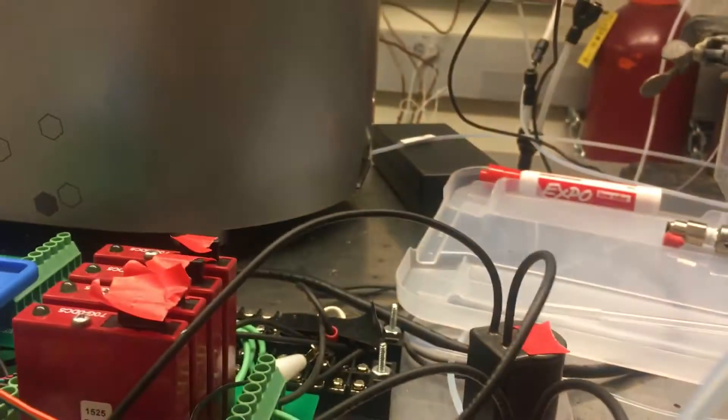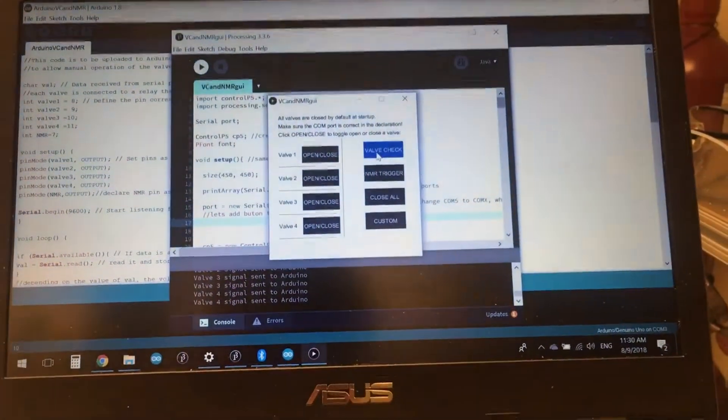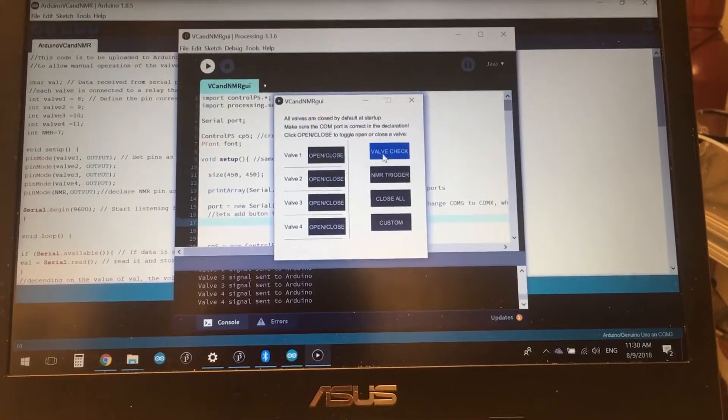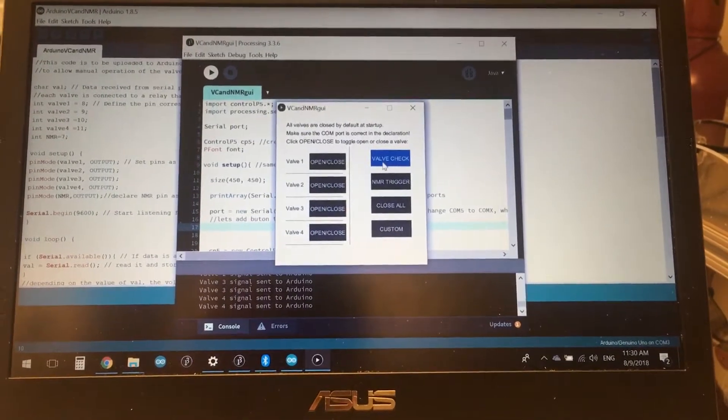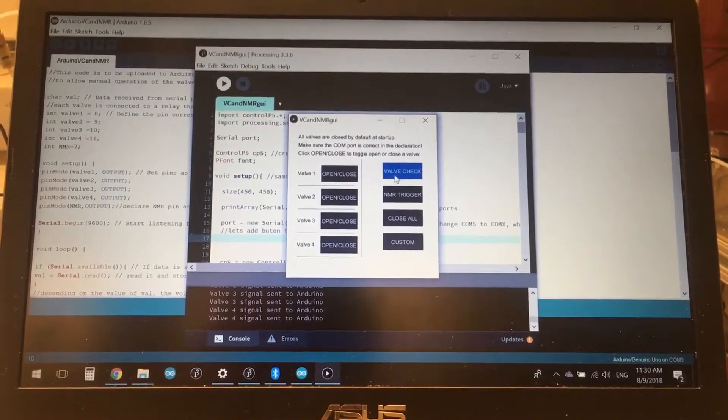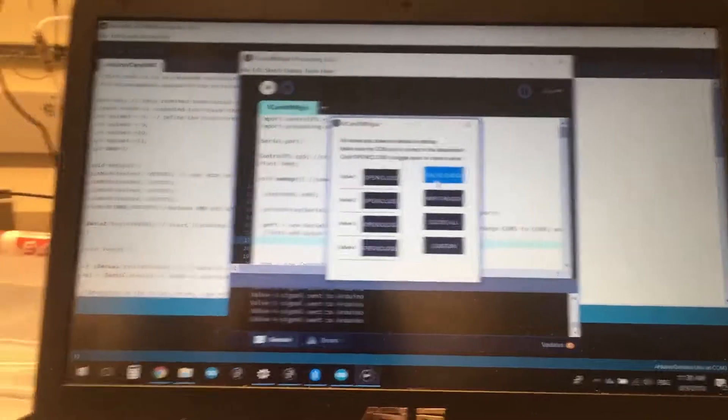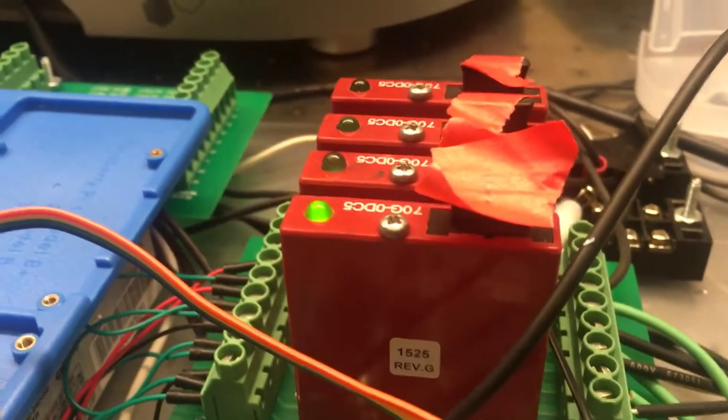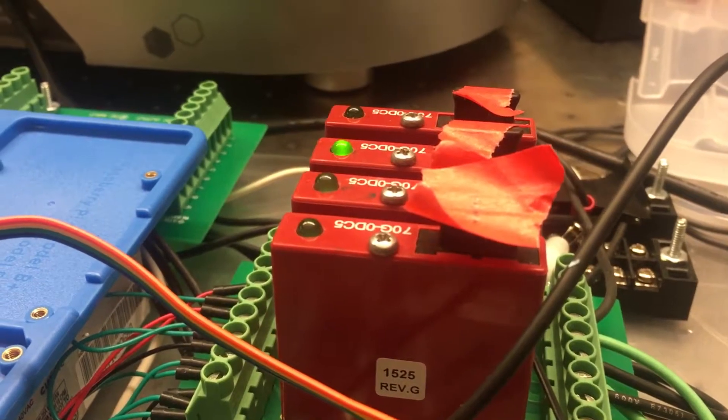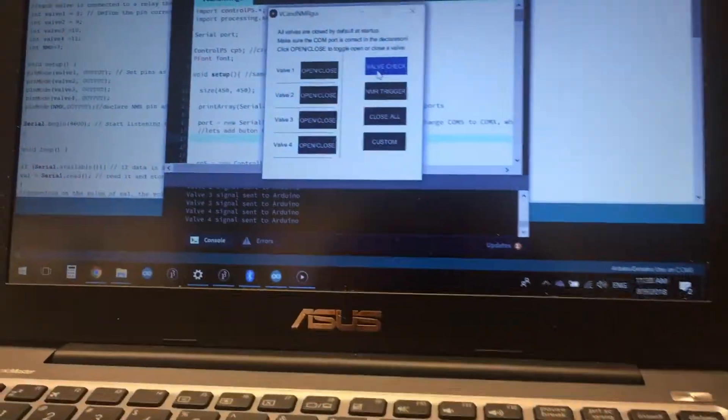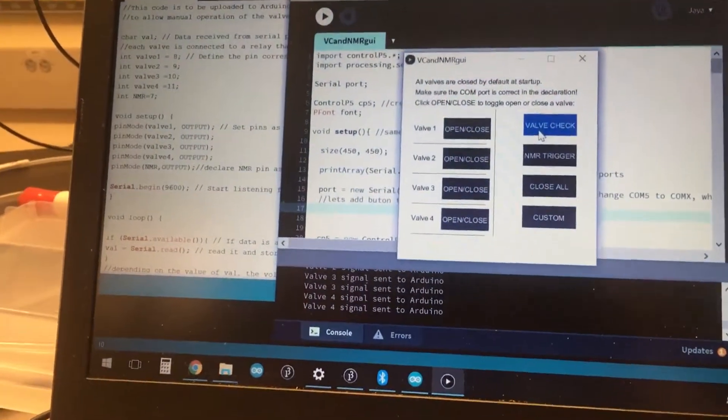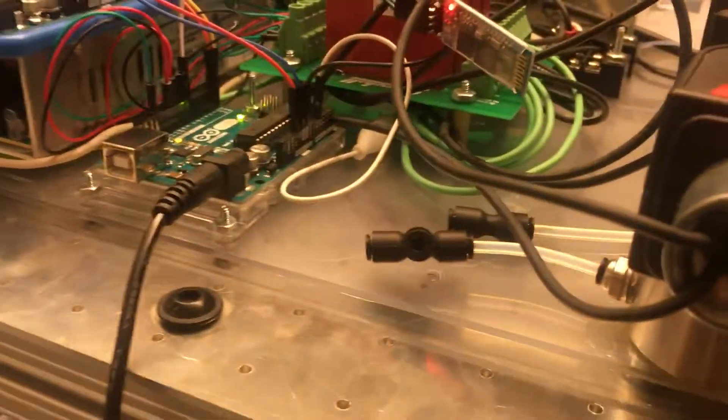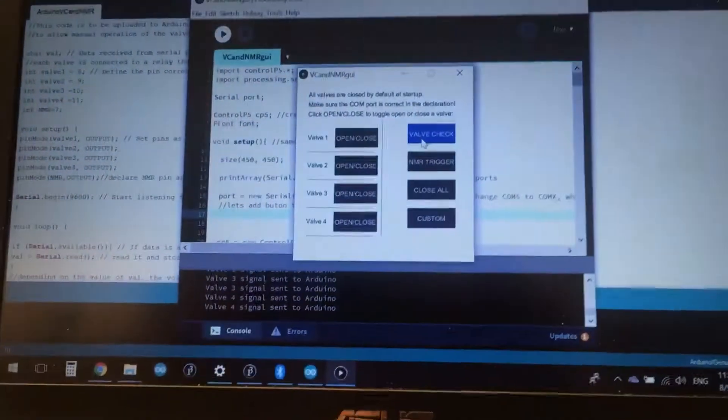What we can also do is perform a valve check using this button. The nice thing about the processing code is it will let us define and script a lot of our sample preparation tasks, so this would be an example of it. If we click valve check, it will iterate through the valves in a precise manner that's controlled by the Arduino here and the processing code. All of our presets and scripts are defined within processing, and the processing code will then control the Arduino itself, which operates the valves.